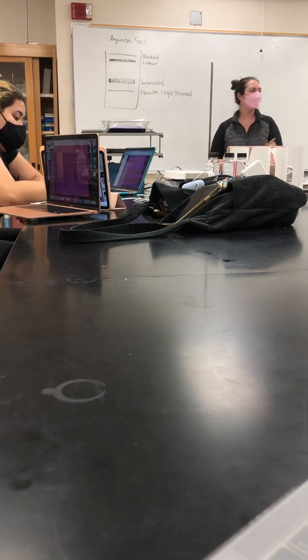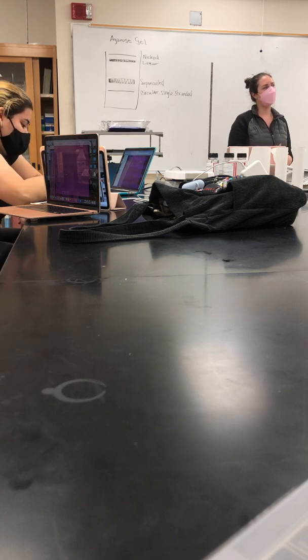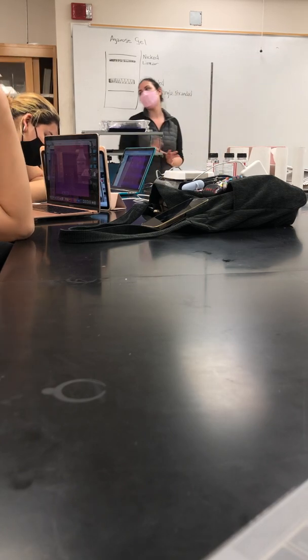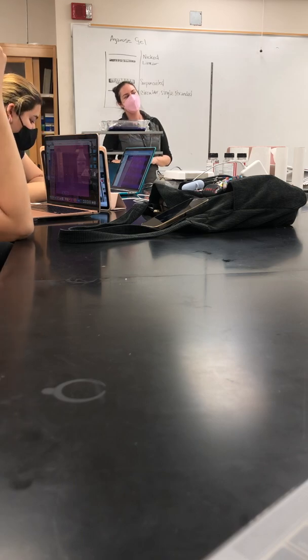For all of you. Acrylamide, it was the smaller size. I remember, I had it somewhere. You might be tested on that. The highest was around 800. The lowest was probably around 50, around that kind of size. Anyone else have for agarose and acrylamide? You guys have computers, did you not email it to you guys? Are you asking what size range they separate best at? Yes, thank you. Polyacrylamide is 10 to 800 nucleotide bases, and then agarose is 300 to 50,000. There we go. 800. Yes.